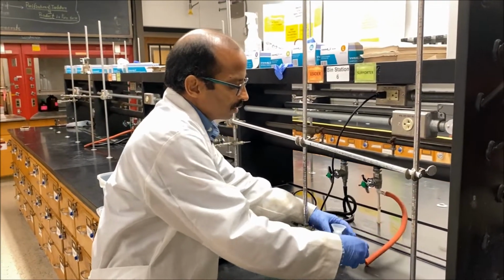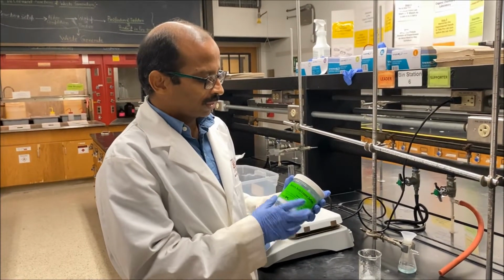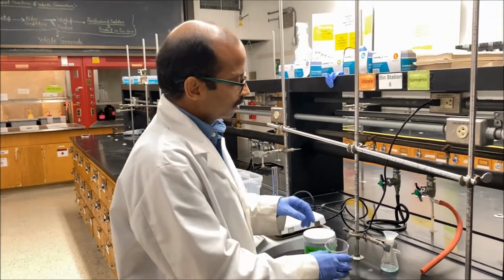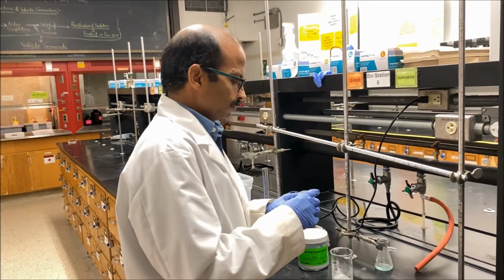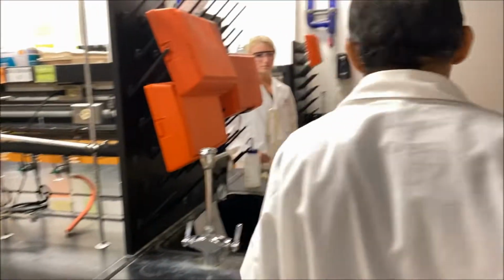What are you working on? I'm doing my first experiment, which is a recrystallization of benzoic acid, and I got my nice crystals here and here. My experiment is over. Maybe I have to weigh my compound and then, okay, it's done.